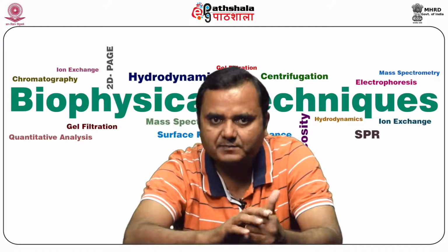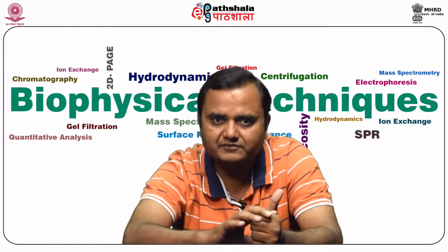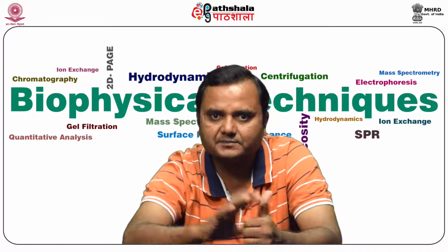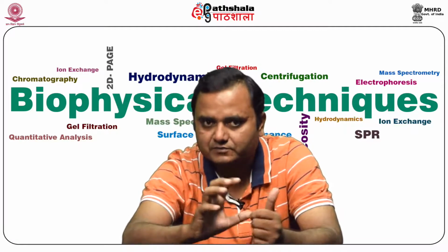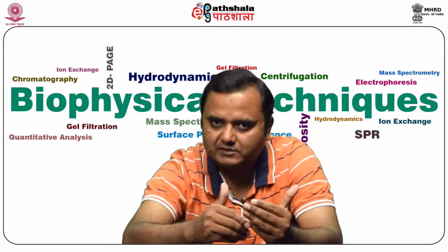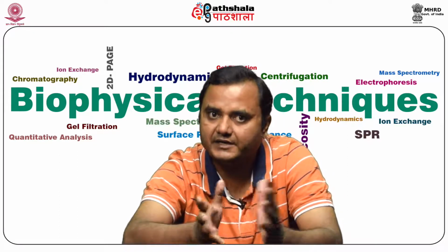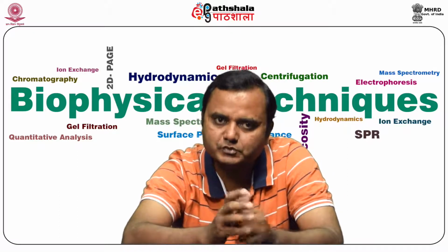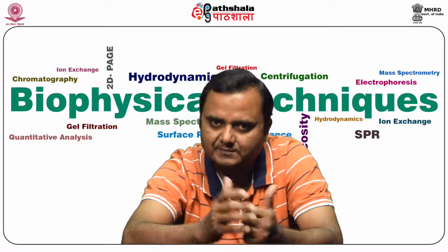The forces applied to the molecule are the gravitational force and the centrifugal force, which depends upon the speed, the time and the radius of the rotor. Now, centrifugation is again classified into two groups depending upon the application. What are the possible applications?